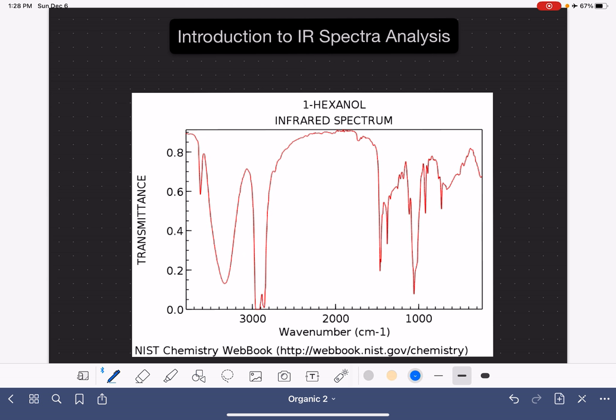When you're analyzing an IR spectrum, the very first thing that you should do is begin by drawing two lines: one line at the 1500 wavenumber mark, and then a second line at the 3000 wavenumber mark. We want to divide our spectrum up into three different parts. We're going to analyze these three different parts separately.